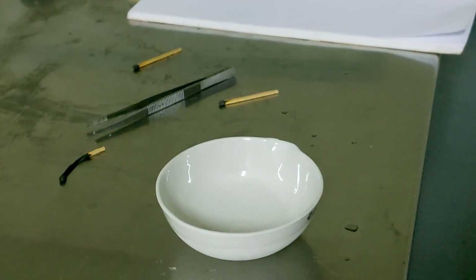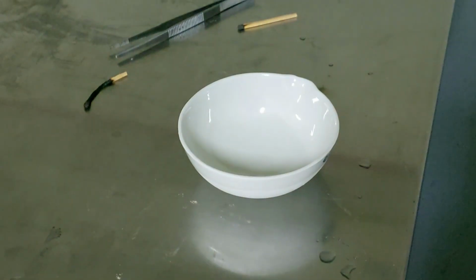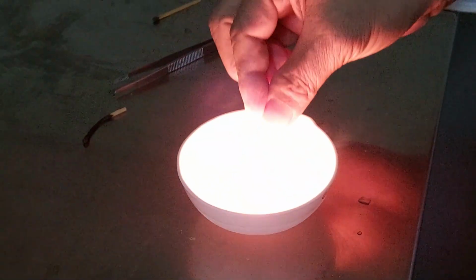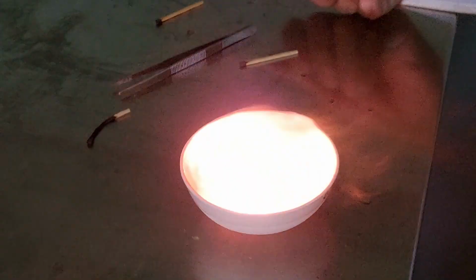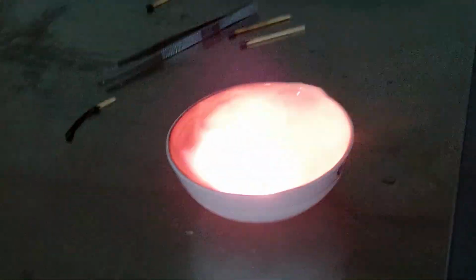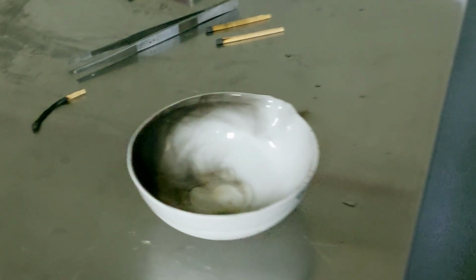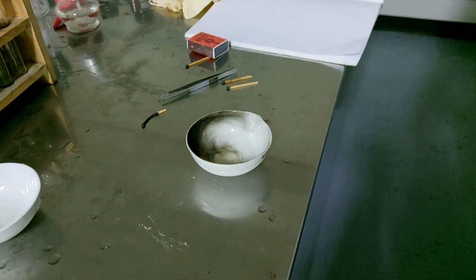Okay, observe the flame and compare. Now you see that? You see the difference now? You have a lot of carbon for benzene. So that's it. For alkane versus aromatic, you can differentiate them from their ignition test.